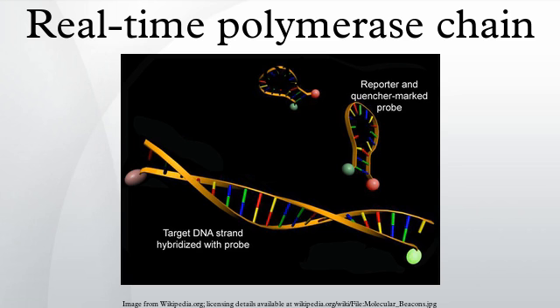Relative quantification is easier to carry out as it does not require a calibration curve, as the amount of the studied gene is compared to the amount of a control housekeeping gene. As the units used to express the results of relative quantification are unimportant, the results can be compared across a number of different RT-qPCR. The reason for using one or more housekeeping genes is to correct non-specific variation, such as the differences in the quantity and quality of RNA used, which can affect the efficiency of reverse transcription and therefore that of the whole PCR process.